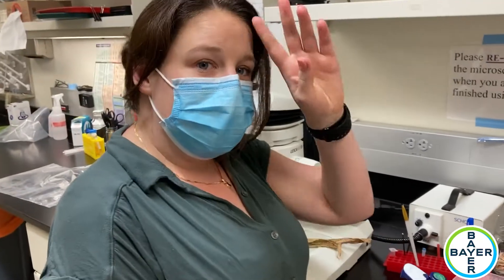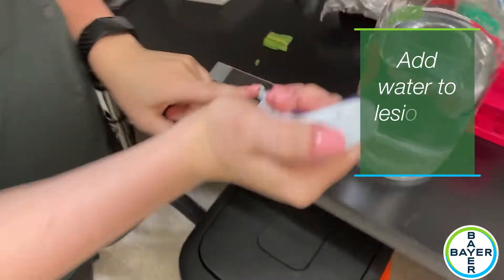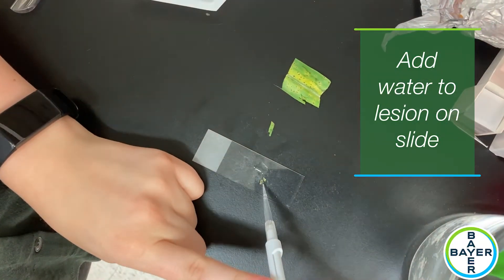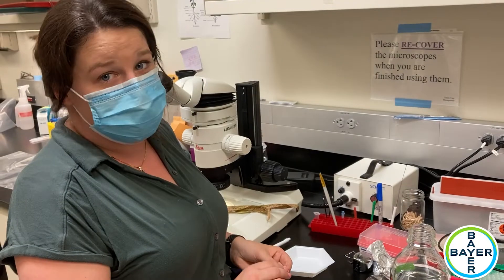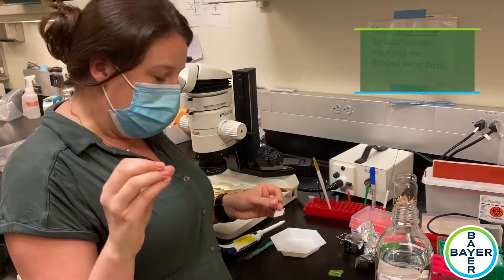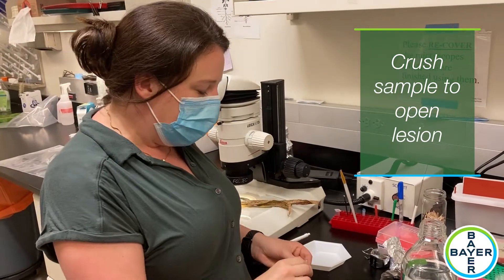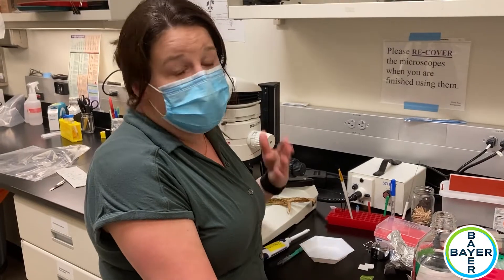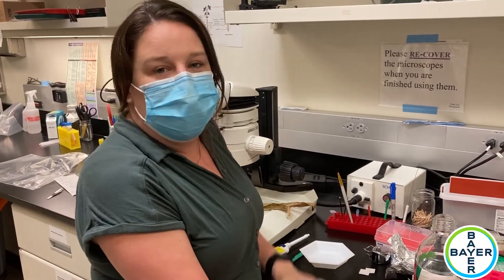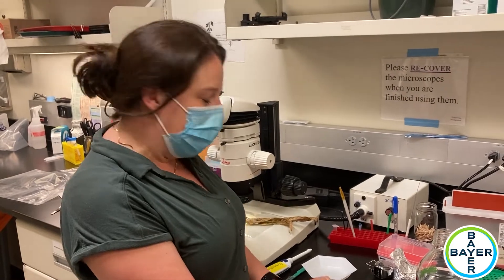I'll add a little water on top of this lesion, and then essentially what I'm going to do is crush it to pop open that lesion — the little brown shell of the stroma, as we call it. Then we'll see what kind of spores are inside. If they look like tar spot spores, we'll call this tar spot; if they look like a different spore, we'll have a different diagnosis.